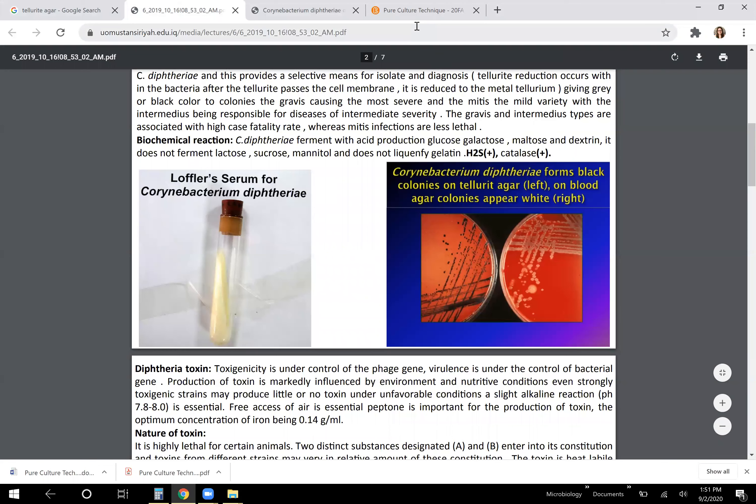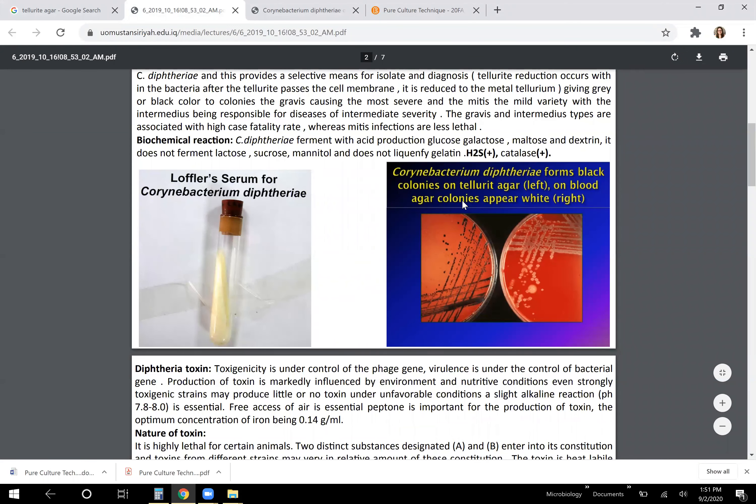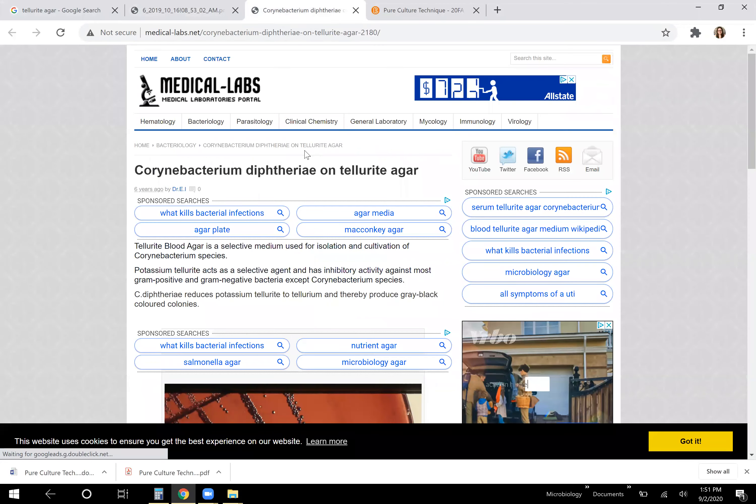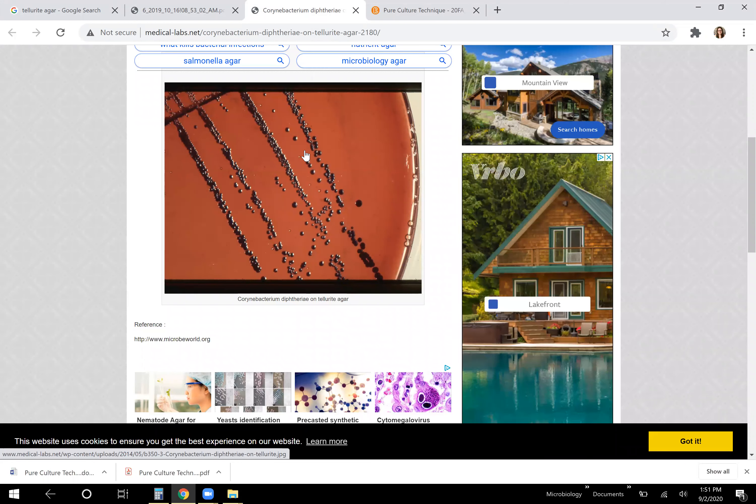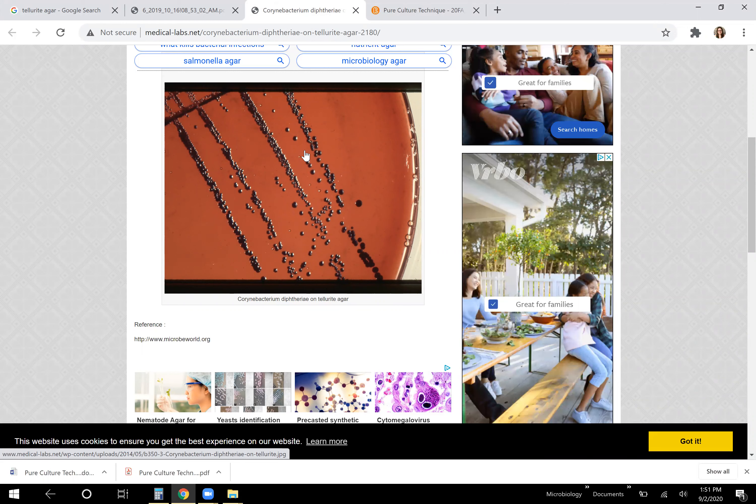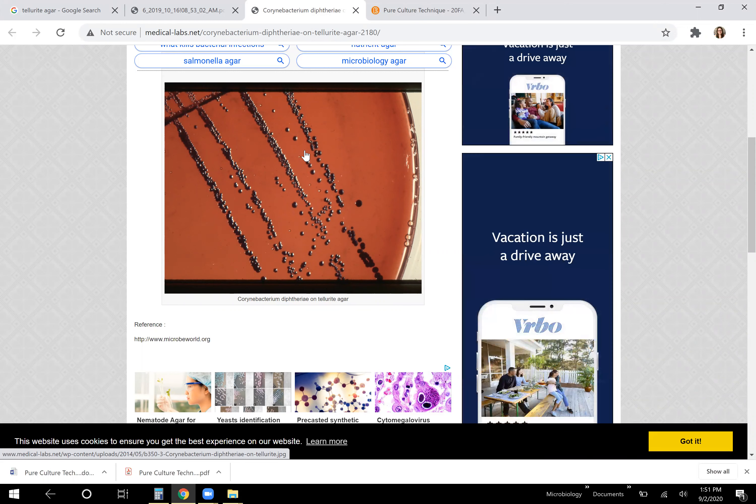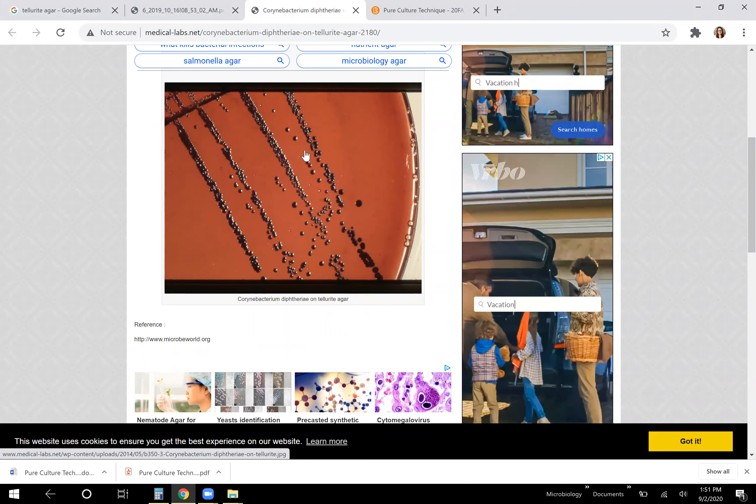They also mentioned the tellurite media as a differential media. So this here is a picture of what Corynebacterium looks like when it's growing on tellurite agar. Tellurite agar contains something extra in it called tellurite that when it's metabolized by the Corynebacterium genus, it will cause the colonies to take on a black color.